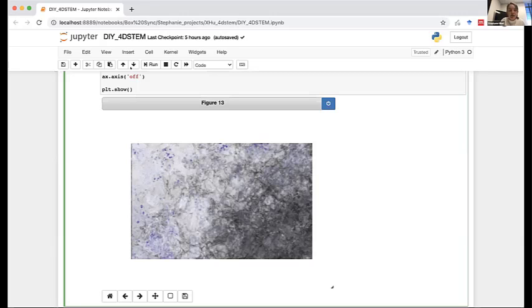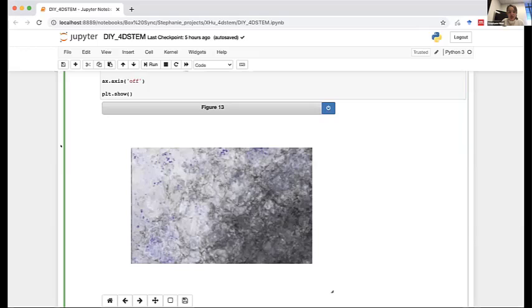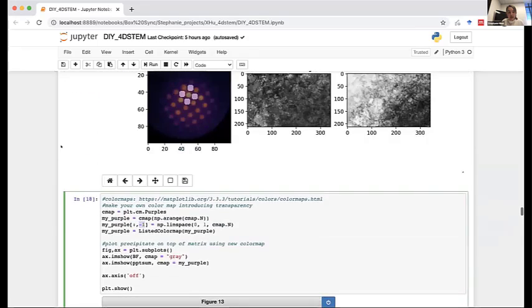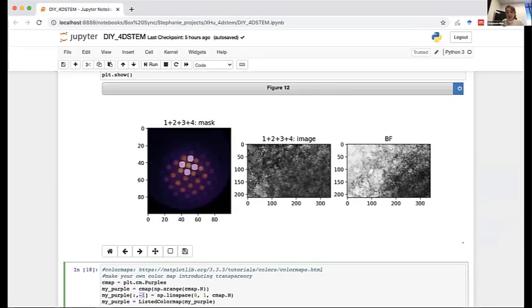Yeah, exactly. It depends on the function. A lot of the averaging steps take more time, but the masking and running through to integrate this is surprisingly quick.